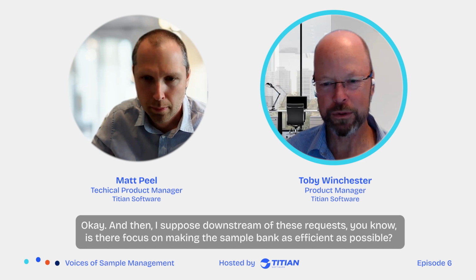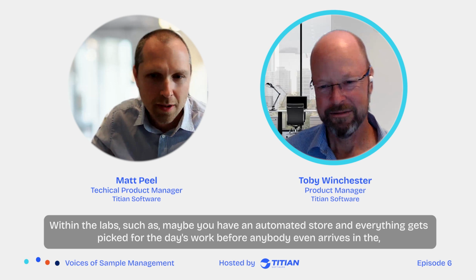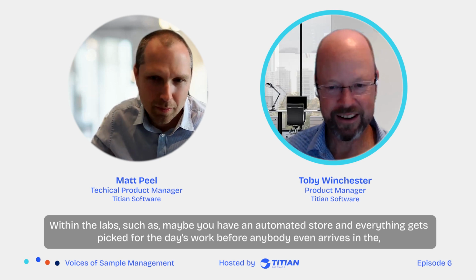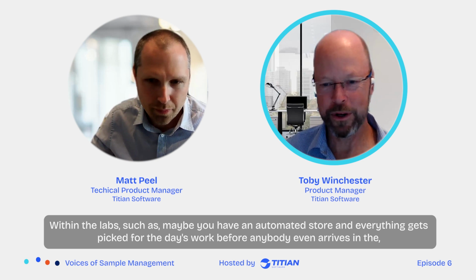Okay. And then I suppose downstream of these requests, is there a focus on making the sample bank as efficient as possible? Maybe describe what happens post the request. What happens in the workflow within the labs? Such as maybe you have an automated store and everything gets picked for the day's work before anybody even arrives, and is that important as well?